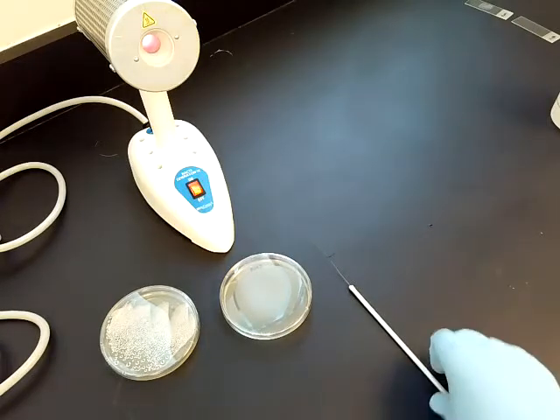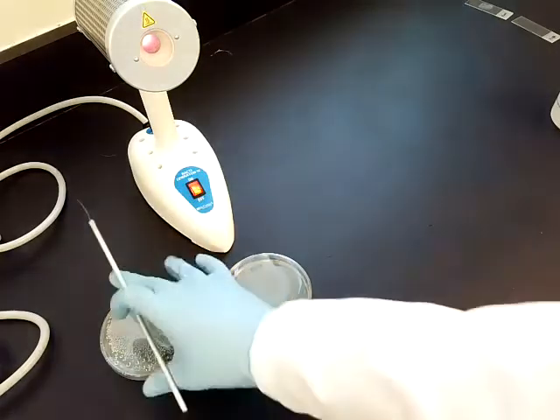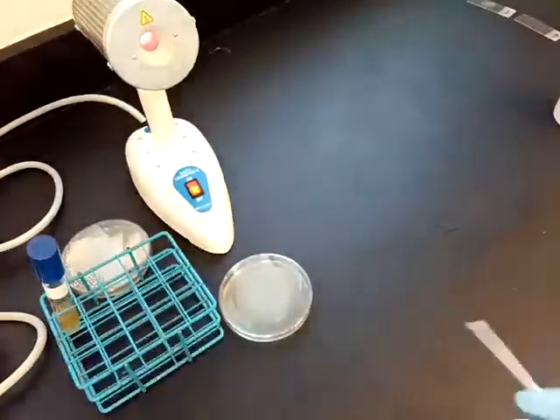In this video, I'm going to talk about the streak plate method. So the streak plate method is a method for isolating microorganisms from a mixed culture. We can do a streak plate method from an agar plate, or we can do a streak plate method from a broth. So I'm choosing to do streak plate method from a broth.